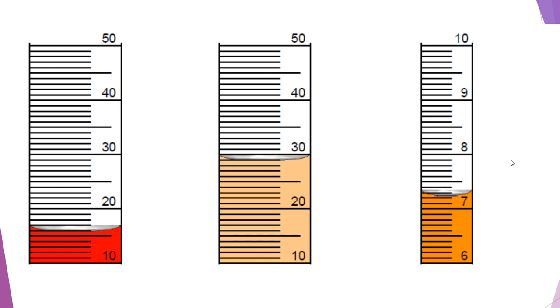So this is 0.1, 0.2, 0.3, 0.4, 0.5, 0.6, 0.7, 0.8, 0.9 before we get to 2. So we are 1, 2, 3, that's 1.3 milliliters. Remember, each hash mark here is a 0.1 division, so 0.1, 0.2, 0.3. So 1.3 milliliters. And there you have all of your measurements for those graduated cylinders.